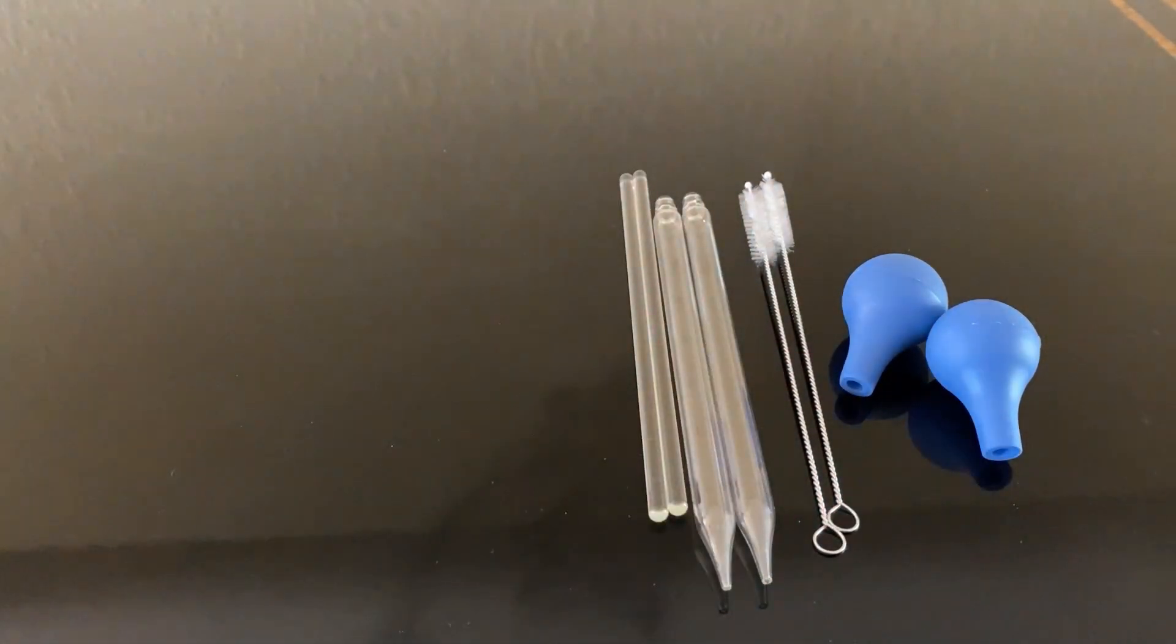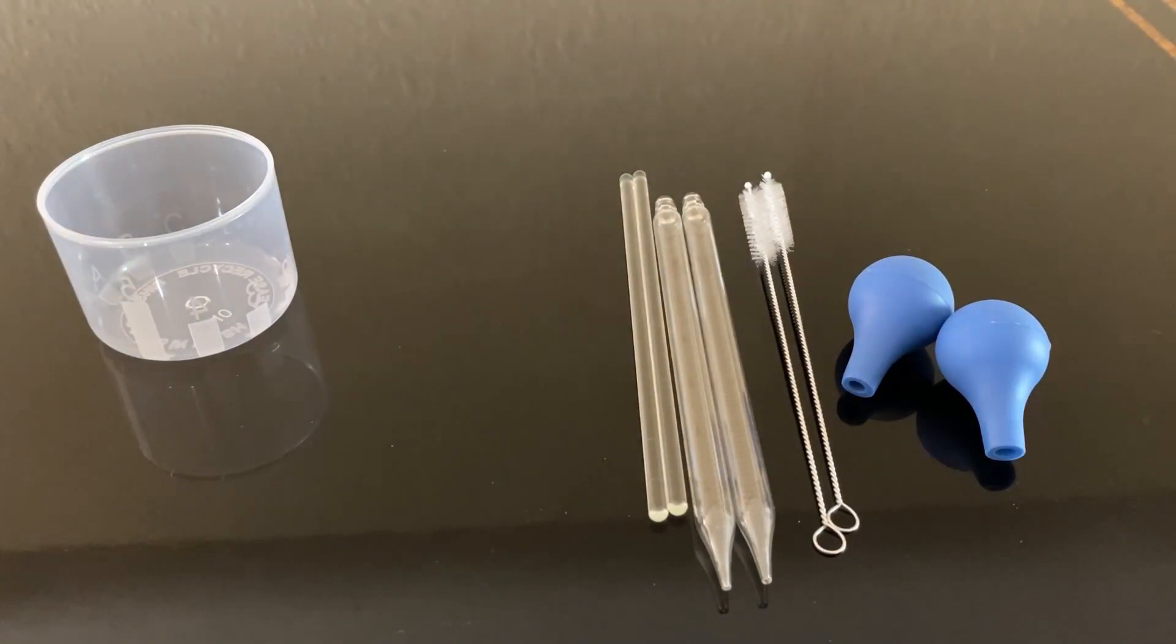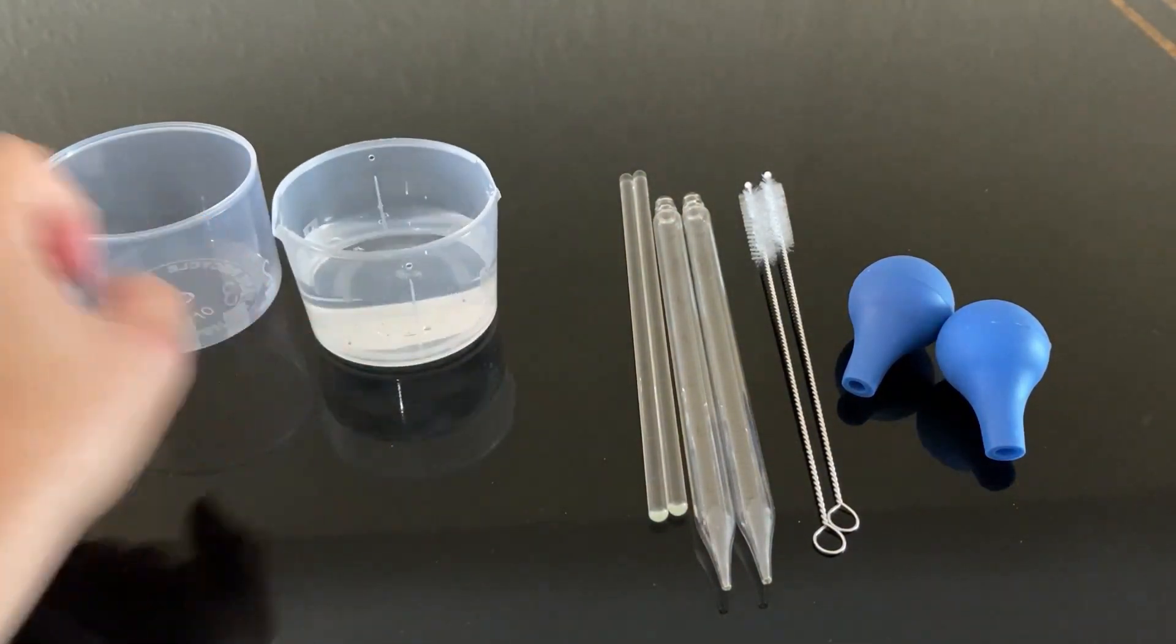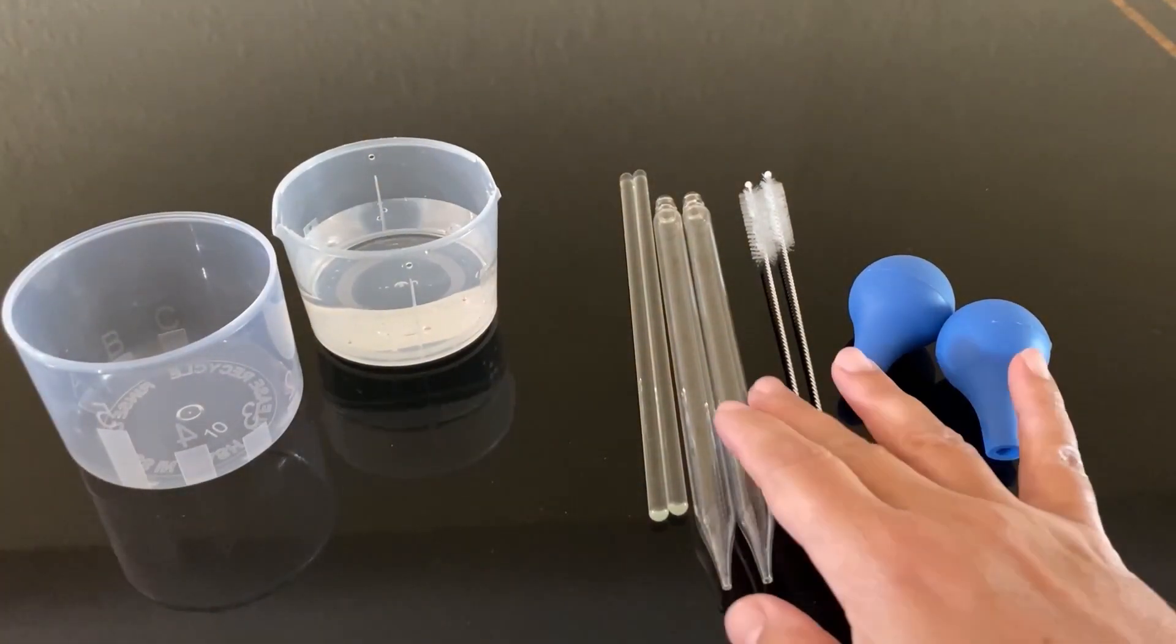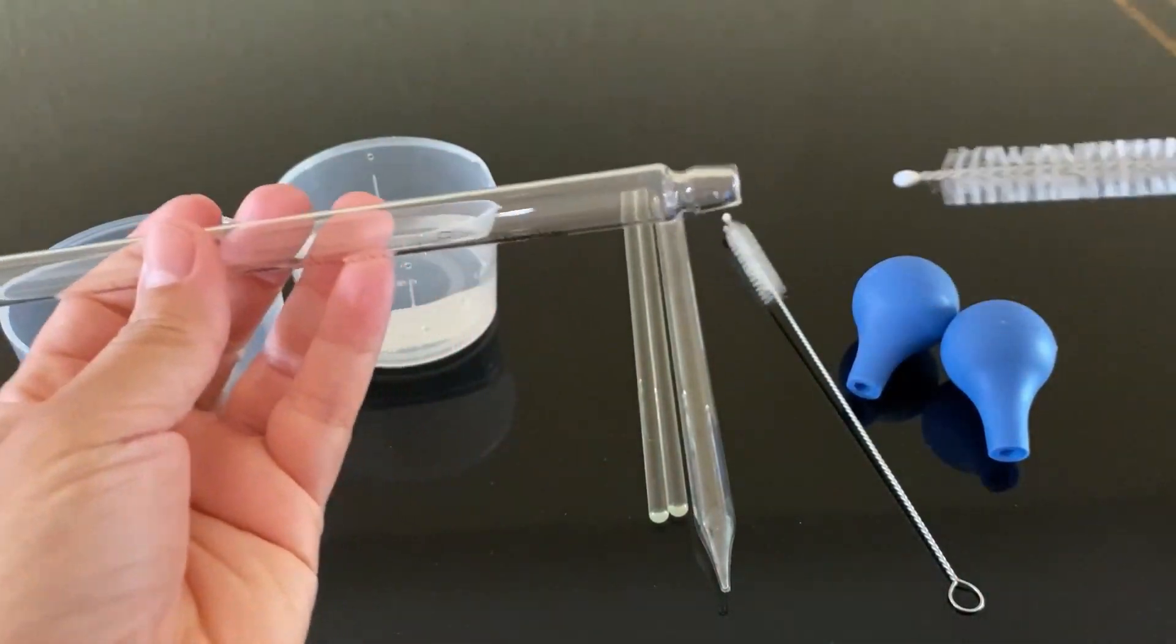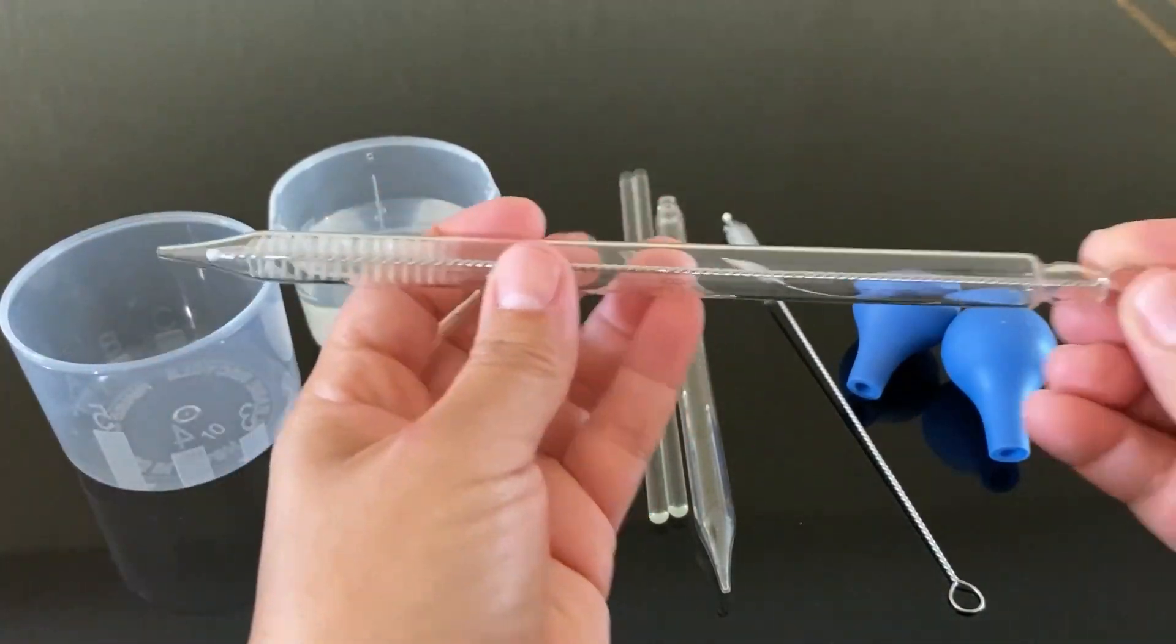Also, the large rubber caps create a tight seal to prevent spills and contamination. The included brush makes cleaning the narrow dropper tubes really easy, as you can see here.